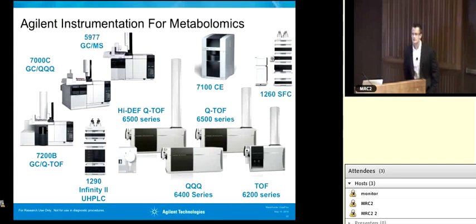And we're going to do this with a slightly more permissive m/z tolerance and retention time tolerance. So it's a two-stage process, and that's why it's called a multi-stage algorithm, because we're going to start wide, if you will, and let the algorithm find things. If you can imagine looking through a pair of binoculars, then you're going to zoom in on them once you've actually found them, because it's awfully hard to try to zoom in on the moon with a telescope before you've found it.